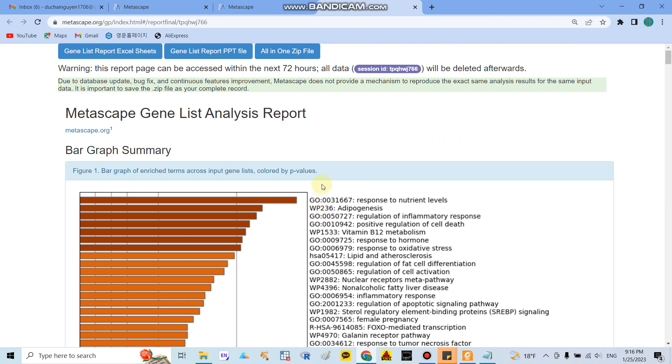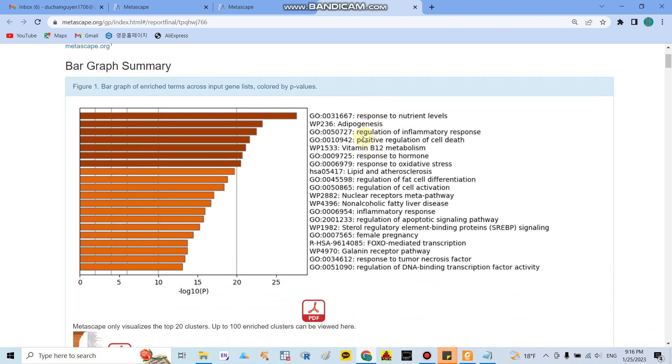In here first they show you the bar graph summary. And here they show you the biological process, the top 20 biological processes that play most roles in the pathology of obesity and targeted by curcumin.